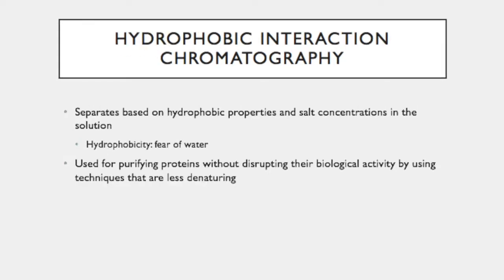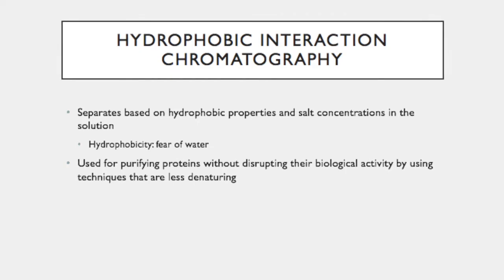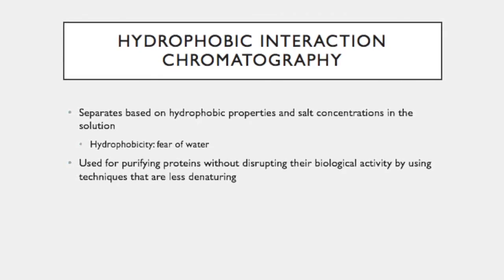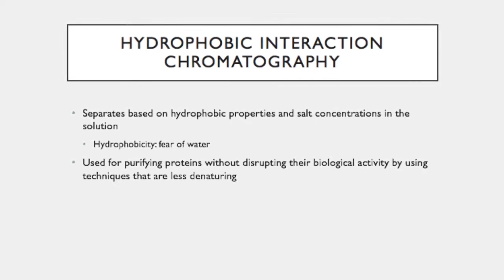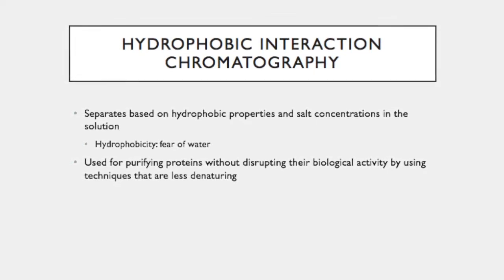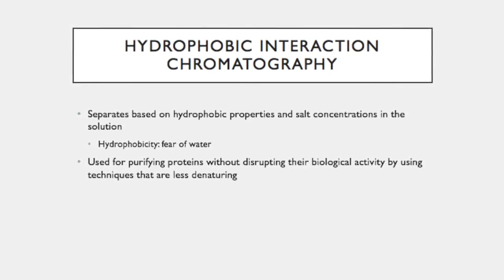So, the last type of chromatography that we're going to discuss today is hydrophobic interaction chromatography. But let's first define the term hydrophobicity. The Greek root hydro means water, and the root phobia means fear. So together we get fear of water.